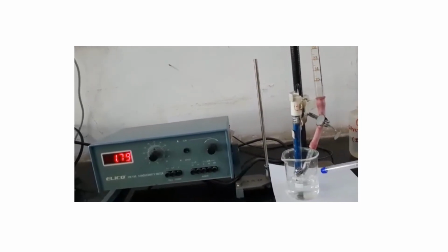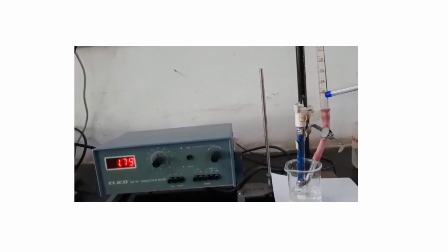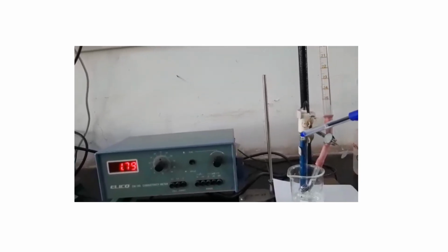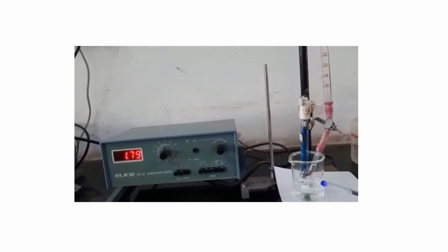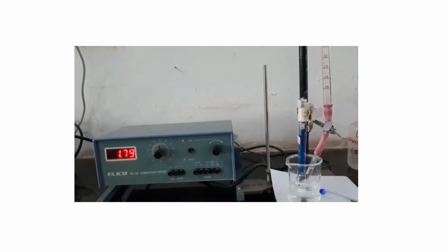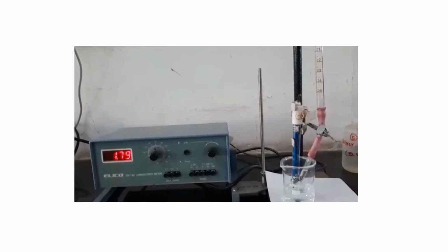In this beaker there is 5 ml acid solution, and this is the burette, it is filled with the alkali solution, that is 0.1 normal NaOH solution, and the conductometric cell is dipped into this solution. In beaker there is 5 ml HCl solution plus 45 ml distilled water. Now this is the setup for the experiment of conductometric titration.